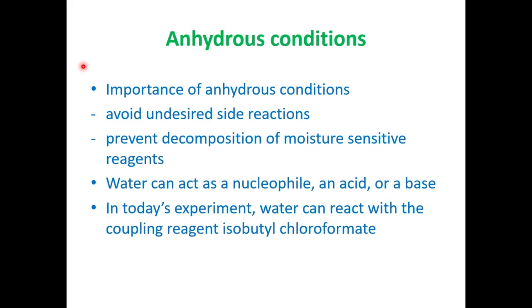I just want to comment on anhydrous conditions. You did note earlier on that we had a balloon and a syringe to access the isobutylchloroformate, and that's because the isobutylchloroformate can react with moisture in the air. So anhydrous conditions can be important to avoid undesired side reactions and prevent decomposition of moisture-sensitive reagents. Water in the air or in your solvent can act as a nucleophile, an acid, or a base, and it can conduct unwanted side reactions and give you complex products that you're not looking for. In today's experiment, water can react with the coupling reagent isobutylchloroformate.